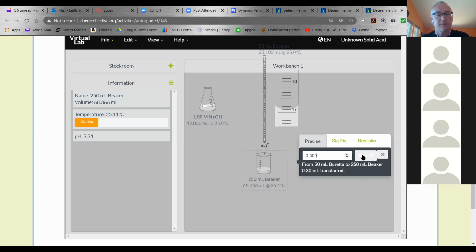7.6. So man, I am getting close here. It's not pink yet. What if my pH was like 9.45? Is it pink? It's not shot up. It's slightly pink. That's perfect, even though it's more than 8. That's exactly what you want. You want it to be just barely pink. If it's bright pink, it's too far.